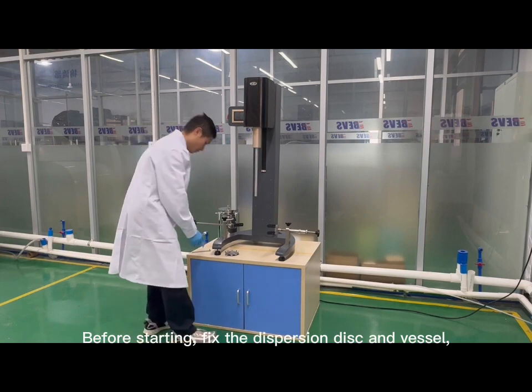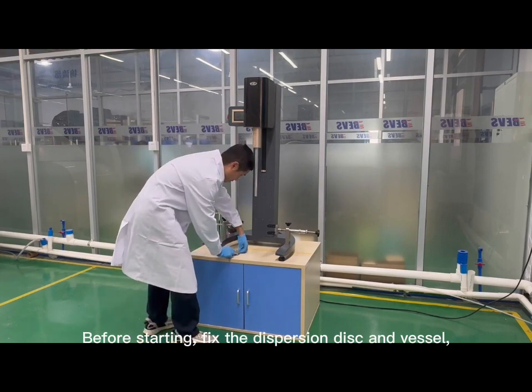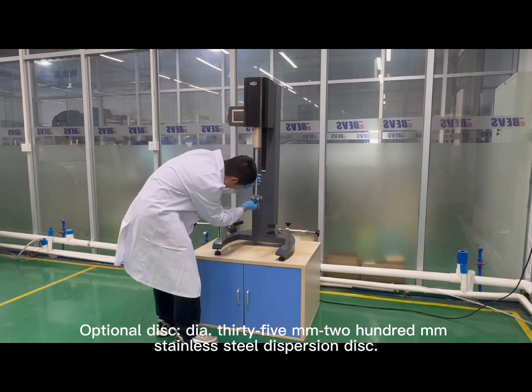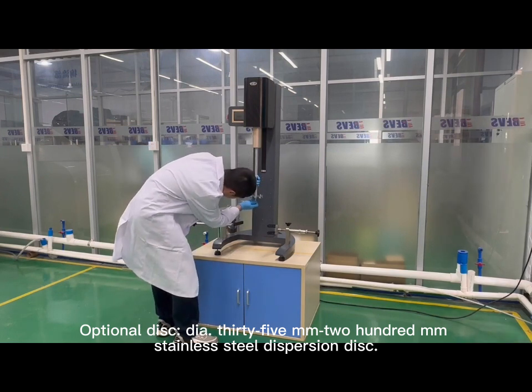Before starting, fix the dispersion disc and vessel. Optional disc sizes range from 35mm to 200mm stainless steel dispersion disc.